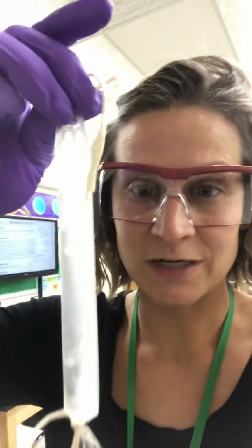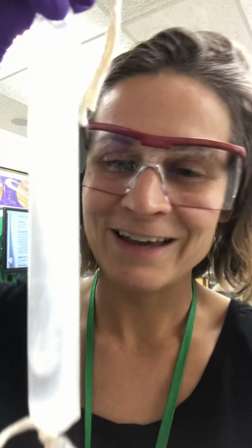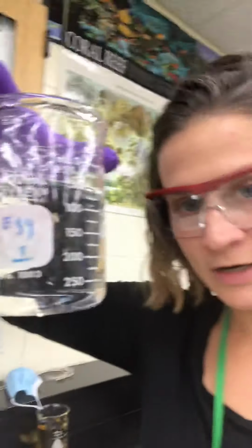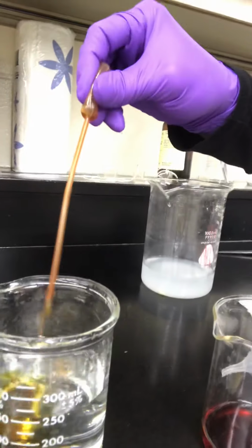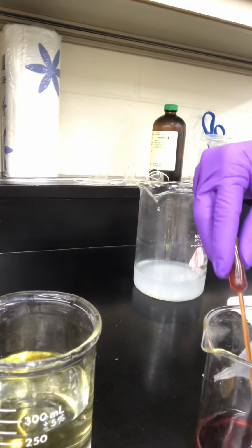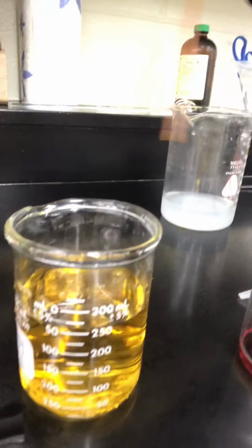Okay, so in this lab I've made a little bag for you, and it has a starch water solution in it. This tube is called dialysis tubing, and it's full of starch water. What I'm going to do is put it in a beaker of water that has iodine in it. I'm going to go ahead and put the iodine in now so you can see what's happening. So 1, 2, 3 big squirts of iodine.